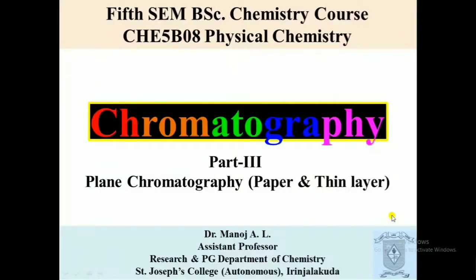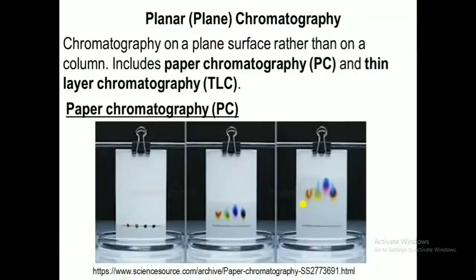Dear students, in the third part of the chromatography lecture, we will discuss plane chromatography, or planar chromatography. There are two kinds of chromatography techniques under the category of plane chromatography. One is paper chromatography and the second one is thin layer chromatography. So we will see what these techniques are.